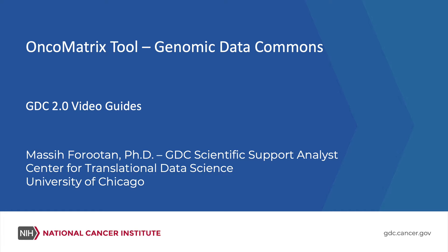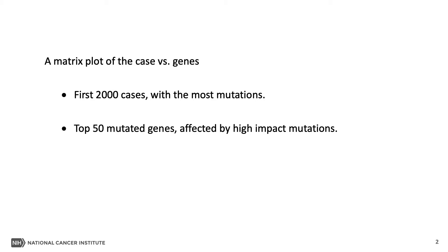In this video, we are going to introduce the Oncomatrix tool. This tool provides a matrix plot of the first 2,000 cases with the most mutations and for the top 50 mutated genes affected by high-impact mutations.